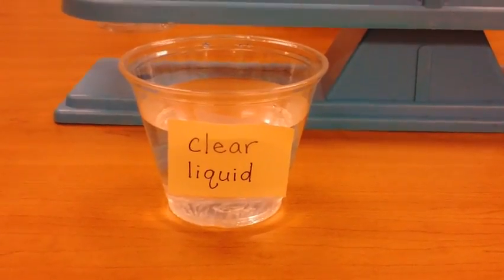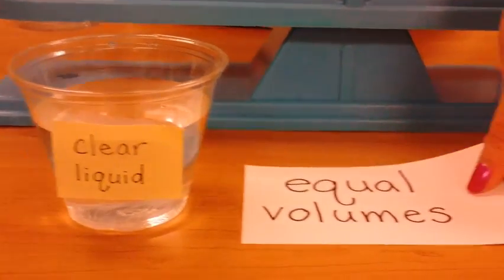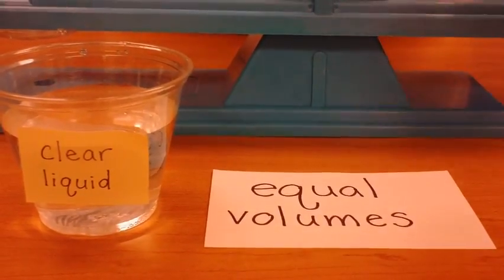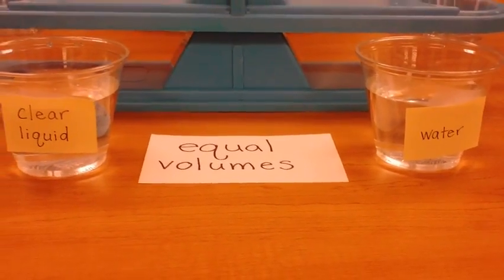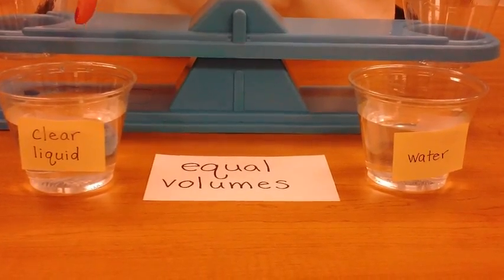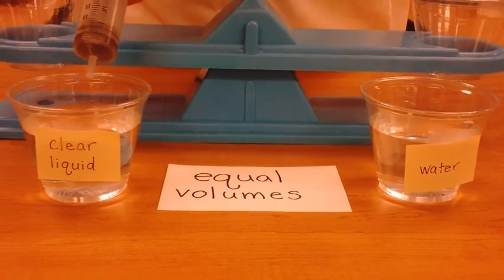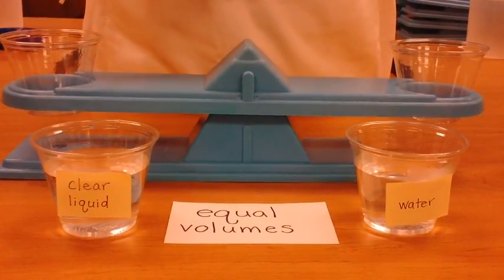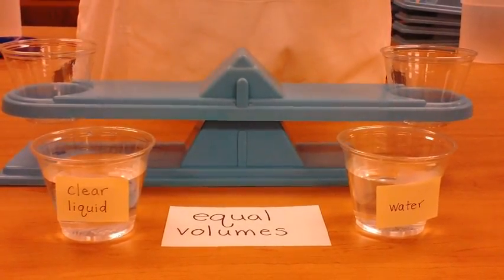Another way to determine if a clear liquid is a solution is to compare equal volumes. If we compare equal volumes of a clear liquid with water, we can compare their concentrations to see if this clear liquid is a solution or to see if it's just water. In order to do that, we use our syringe and take 50 milliliters of the clear liquid and put it on one side of the balance. Then we take 50 milliliters of the water and put it on the other side of the balance.